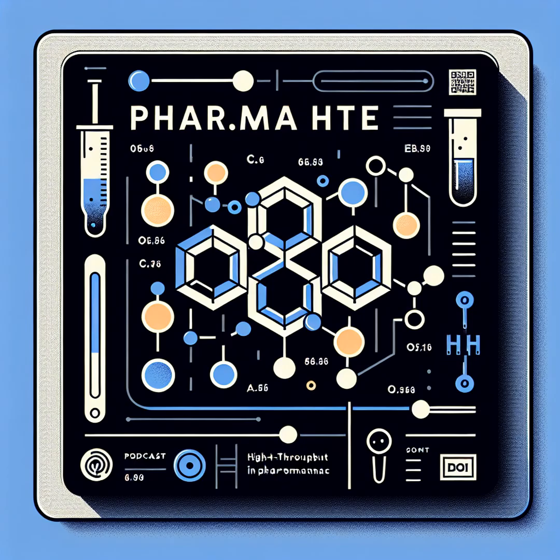What were some of the key findings from the review, you ask? Well, the authors found that HTE is seeing widespread adoption across major pharmaceutical companies. It's proving incredibly effective in tackling a huge range of reaction types, and it's being integrated throughout all the different development stages, from early discovery to manufacturing. And the future? The authors predict that the use of HTE is only going to grow. They see it becoming even more deeply integrated into pharmaceutical manufacturing workflows. It's not just a niche technology anymore. It's becoming a core part of the process. That's a pretty compelling picture of HTE's impact, isn't it?